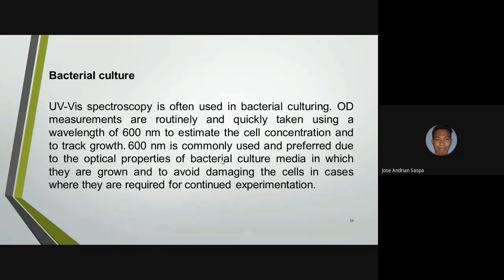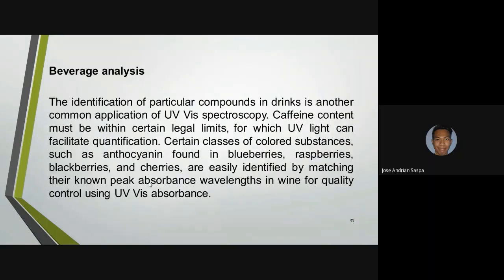So we have bacterial culture. UV spectroscopy is also used to monitor the bacteria used by scientists in the laboratory in bacterial culturing. Then beverage analysis.